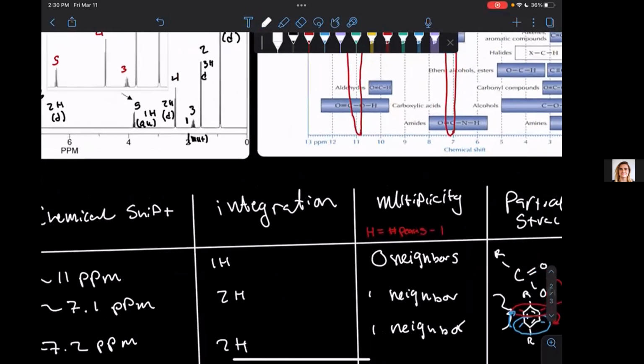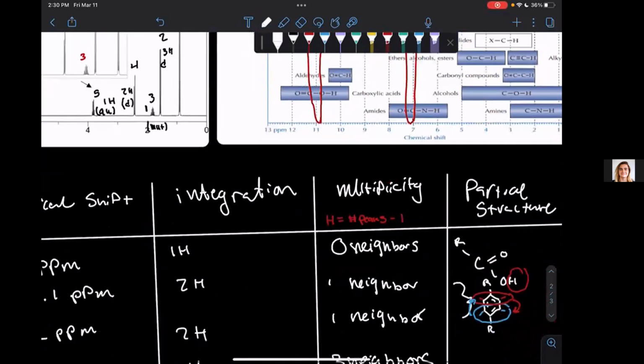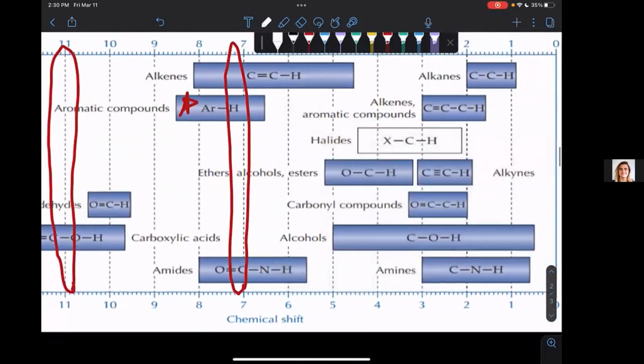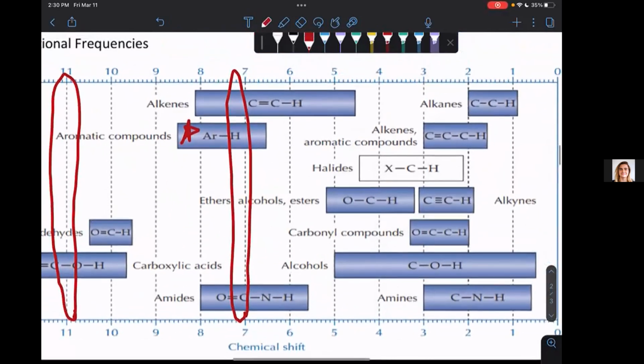And now we're going to look over here once again. So we're looking at almost 4, 3.8, pretty close to 4. And we're looking in this region right here. Let's go ahead, give it a quick draw.